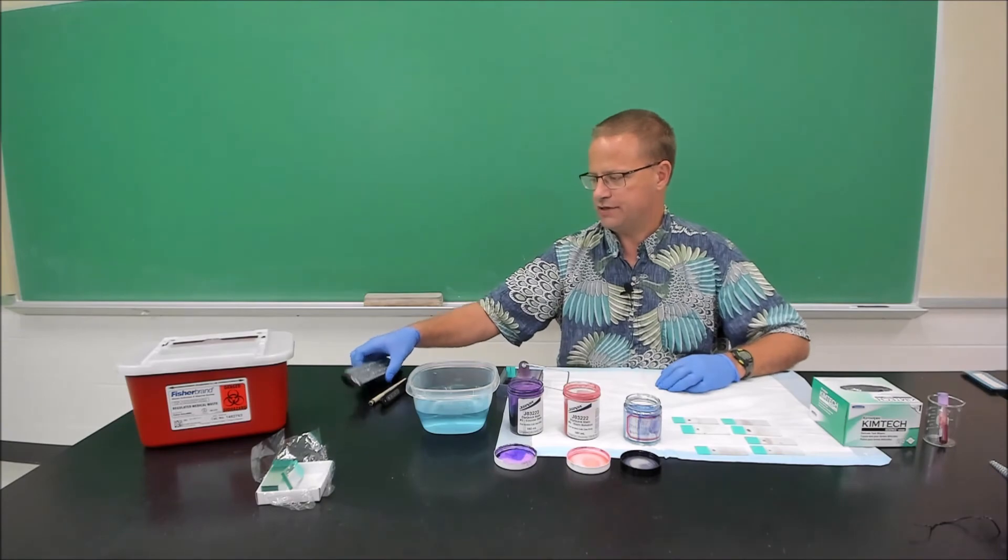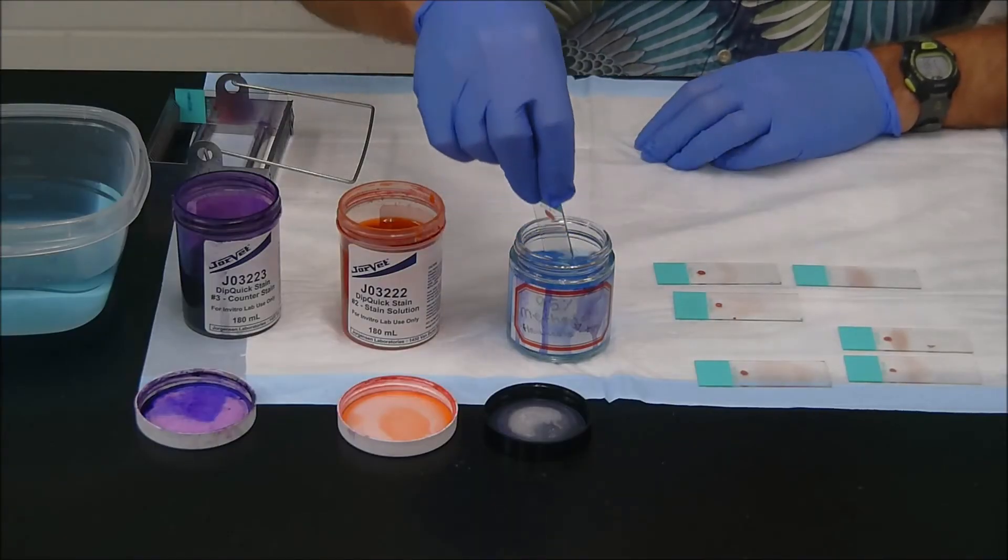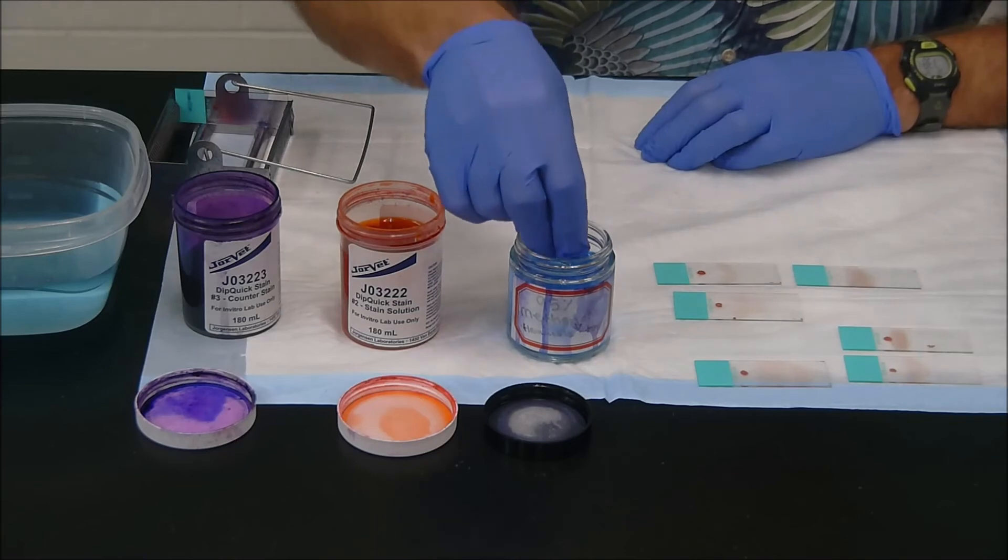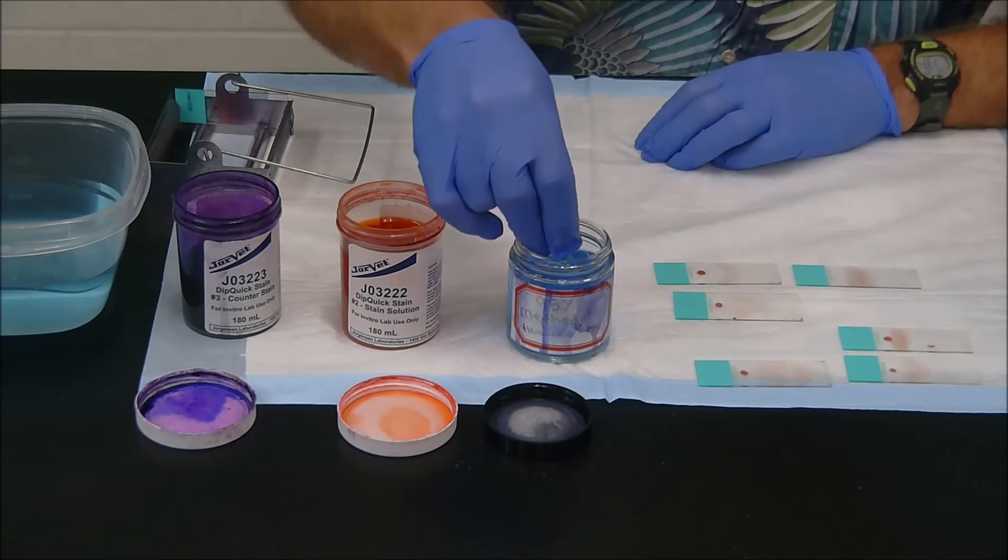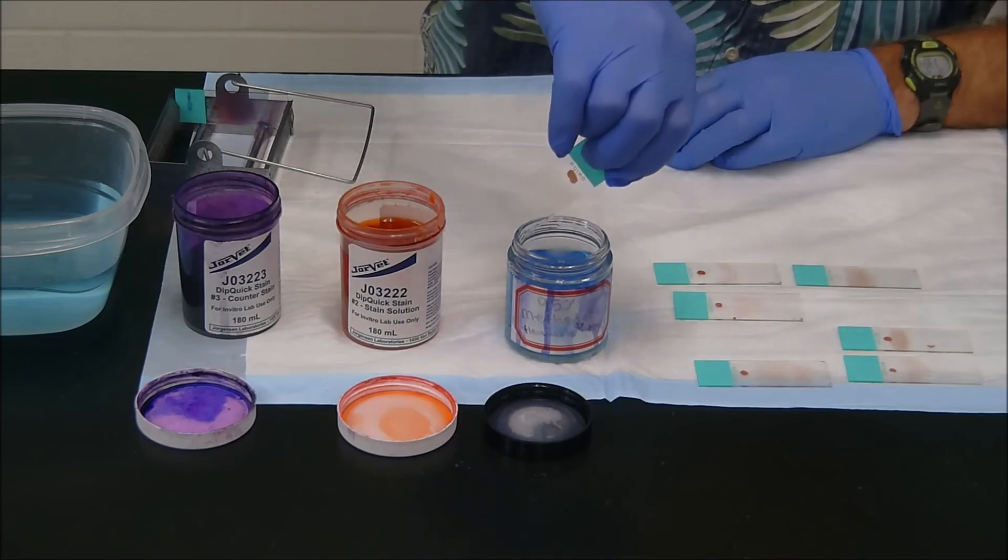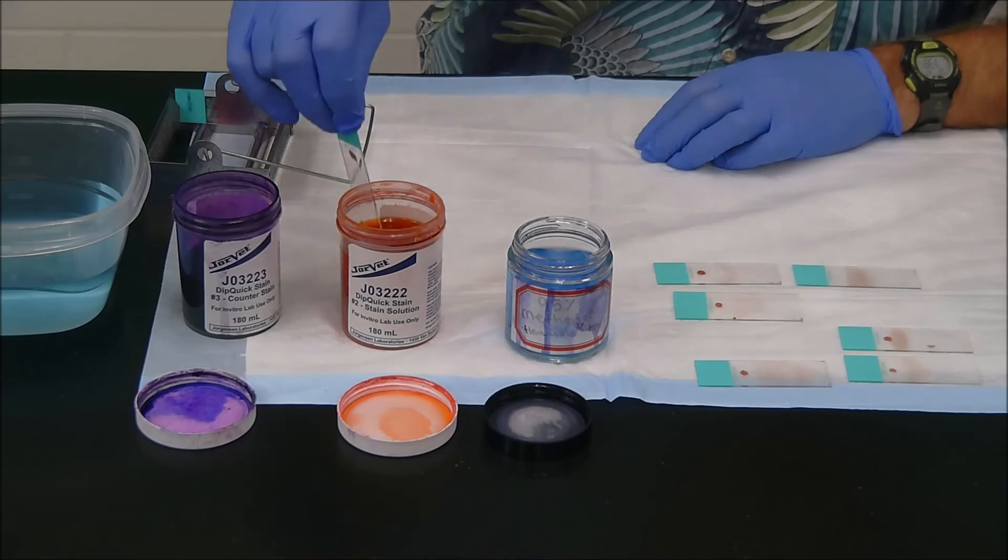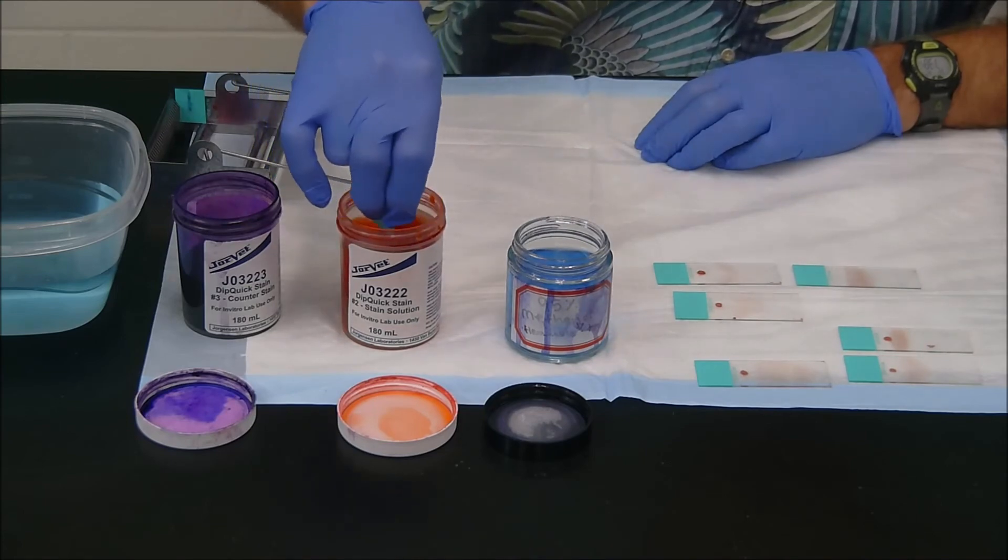Okay. Let's do another one, but zoomed in. So again, I just pick up my smear. Ten dips into the methanol. Get the excess material off there. And ten dips in the eosin. Or I can swish it in there for ten seconds. It doesn't really matter.